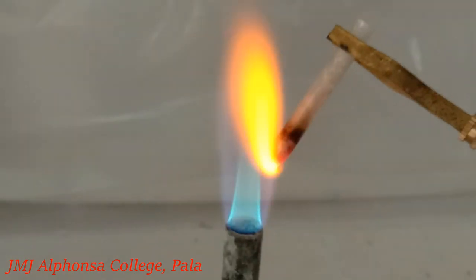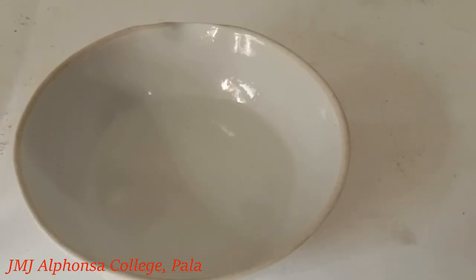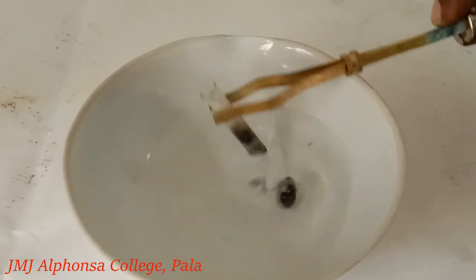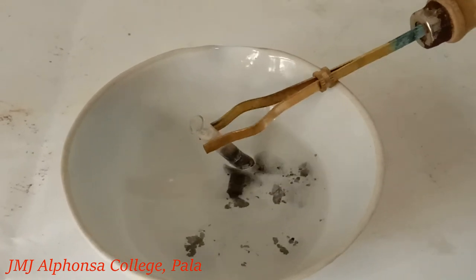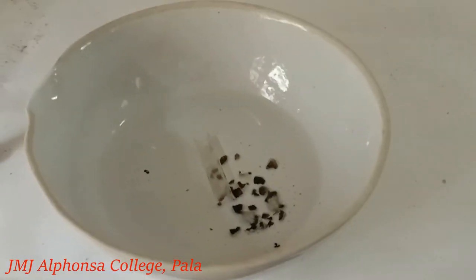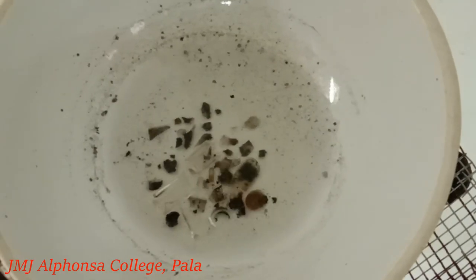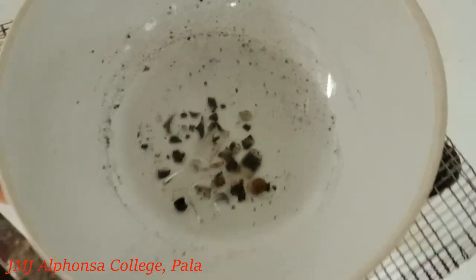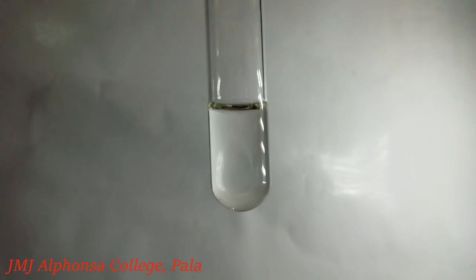When the ignition tube becomes red hot, plunge it into about 10 ml of distilled water taken in a china dish. The tube breaks. Grind the broken ignition tube well. Boil the mixture to one-third of its volume and filter it. Sodium fusion extract is now ready.